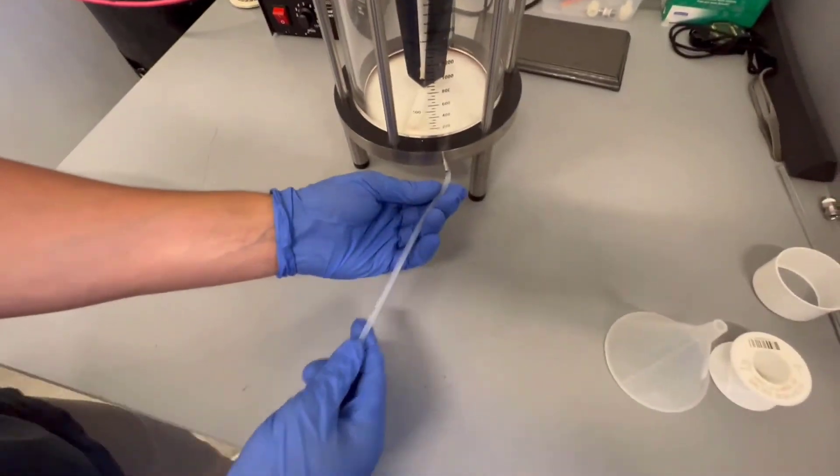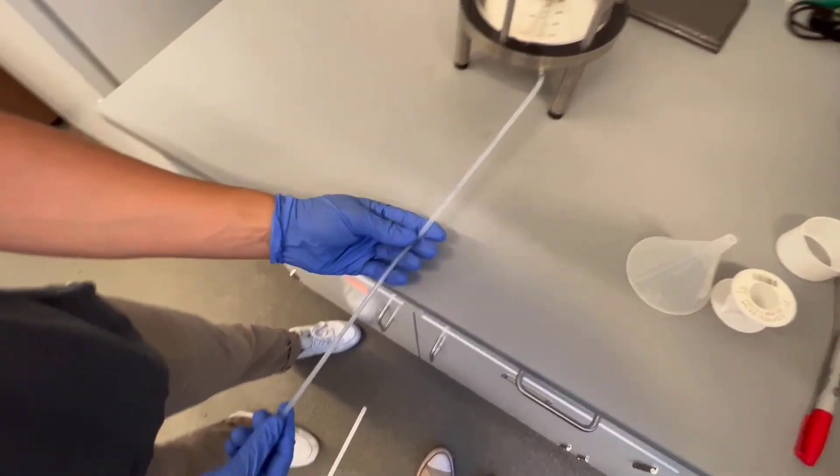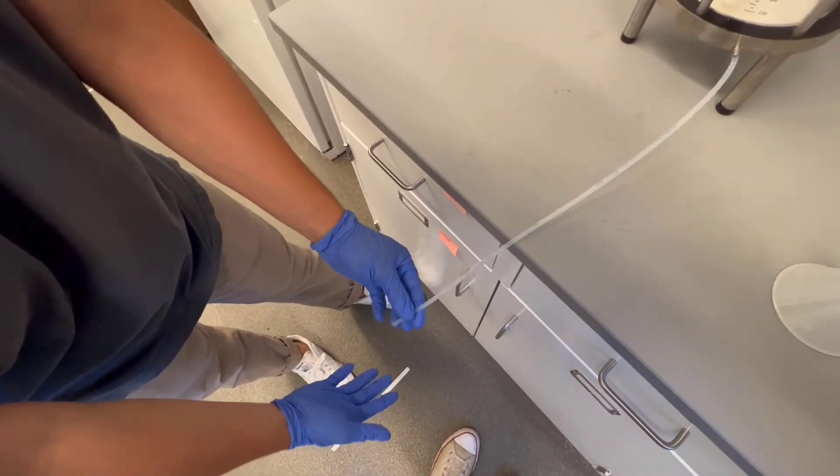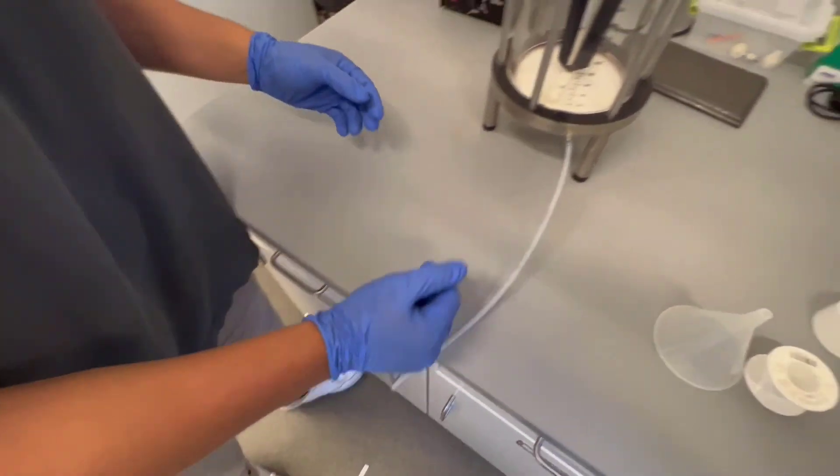And your permeate is going to come out through here, driven by the pressure into a graduated cylinder and scale setup that you have to make your measurements.